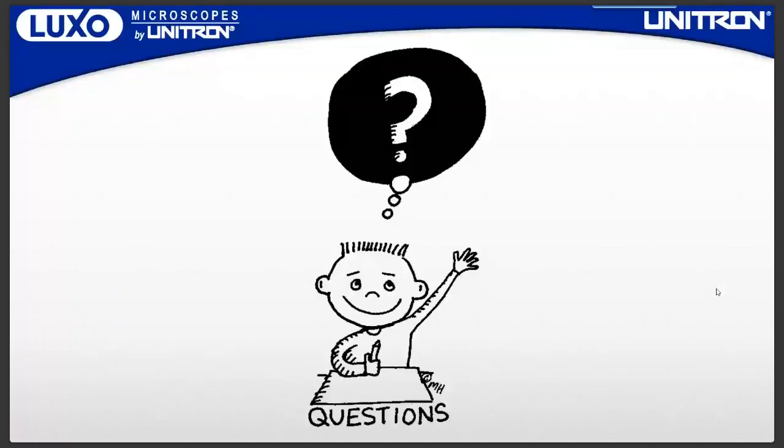So the way I'm doing it here for this webinar is I'm using an accessory we offer. It's an HDMI to USB converter, and you plug that into your PC. The PC can pick it up like any webcam. So it's a generic imaging device. So you're free to use that video feed in any program, whether it be Skype, webinar, anything really. I'm actually running the live feed in the Windows Camera app here. That's how I'm showing you the Omni screen. So yeah, to answer the question, control no, but you can remotely view things. Okay.